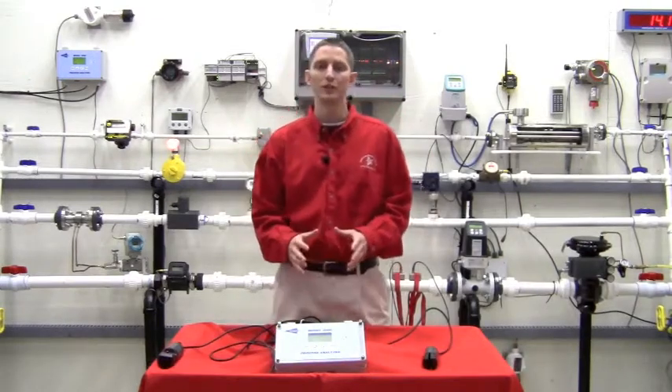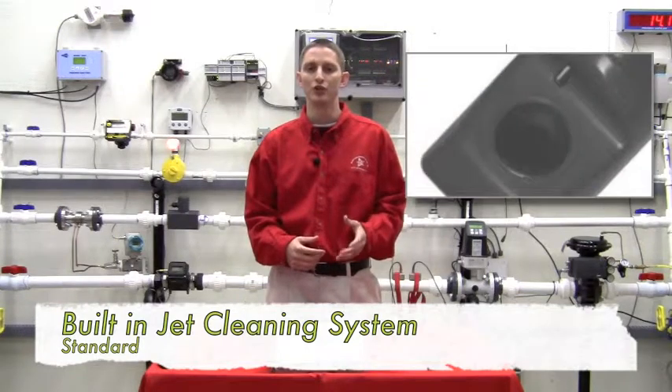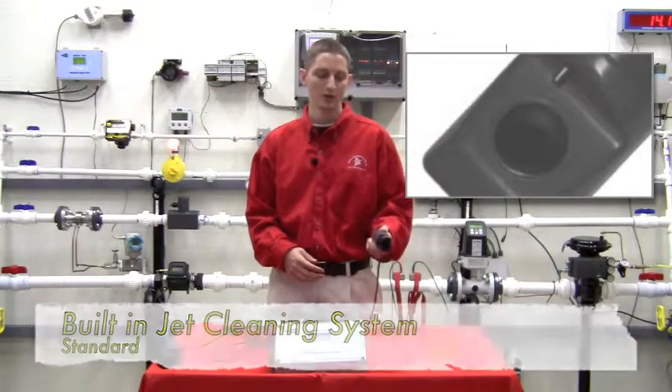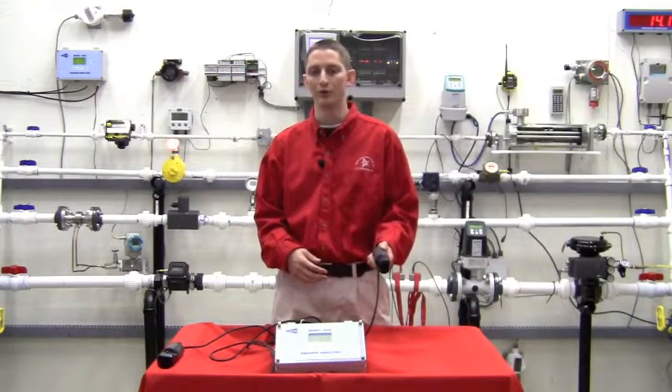There is no routine maintenance for our Insight line. Our sensors come with a built-in jet clean system. All you have to do is simply tube plant air or plant water to your sensor and specify in the electronics how often you want the jet clean system to turn on and clean your sensors.